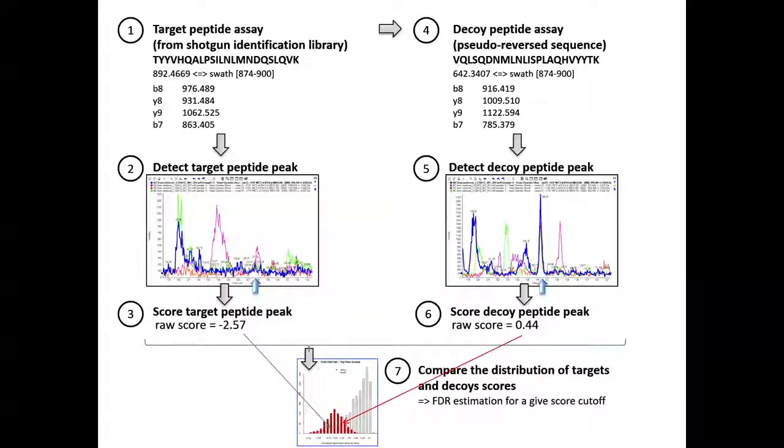So here the target peptide will actually be in the gray distribution on the very left-hand side. While, for example, the decoy peptide here, just by chance, it happens that these 4 transitions, which are not supposed to exist in your data, just happen to find a peptide. Maybe it's one peptide, maybe it's 2 peptides that coelute, we don't know, but it happens by chance that these 4 fragment ion chromatograms coelute relatively well in the middle of the window.